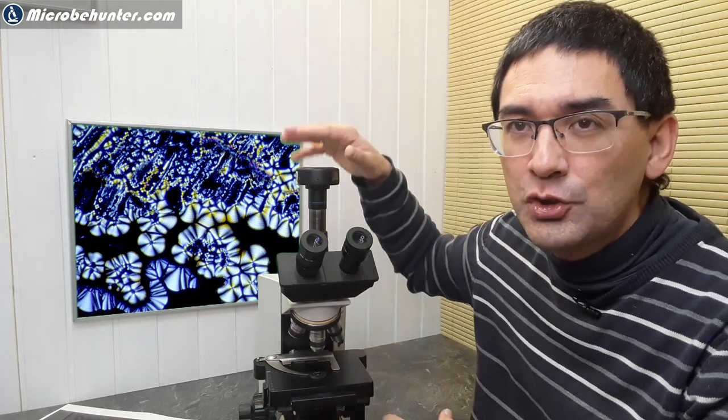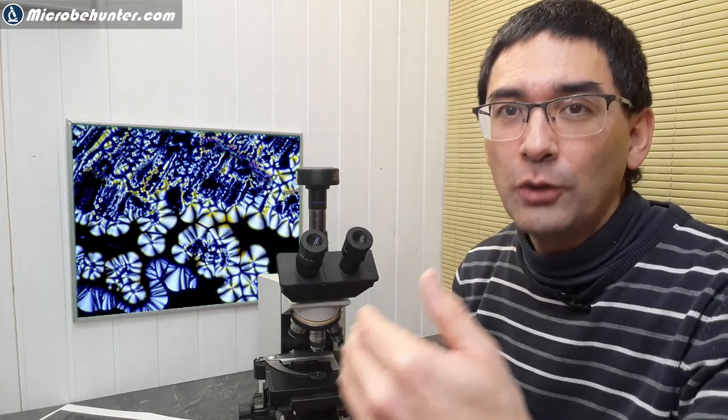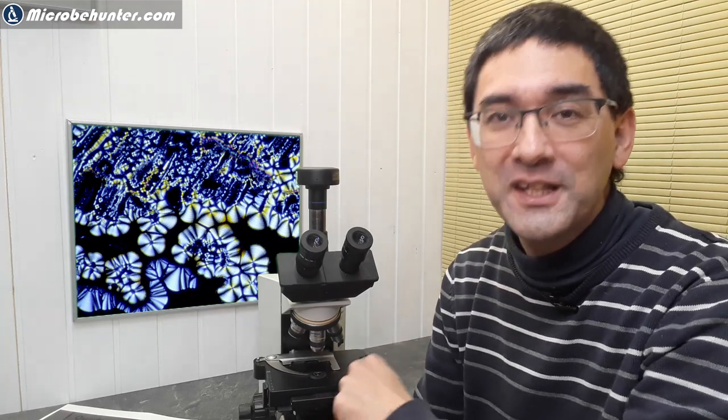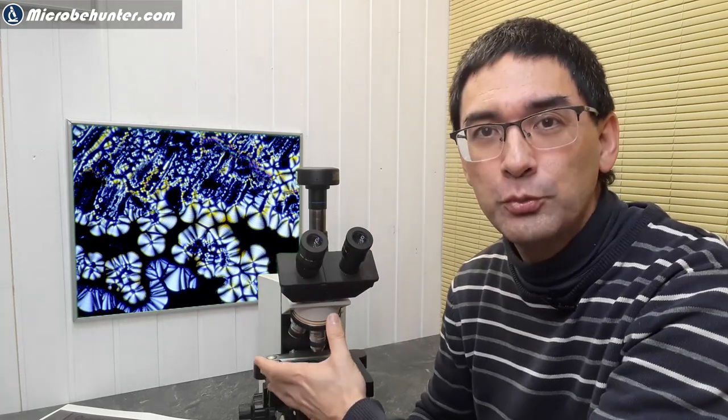However, when we get the magnification on the sensor here and when we display it on a screen, then the total magnification, the total lateral or linear magnification, depends on how large I display the image on the screen. So what I have to do then is divide the size of the image on the screen by the original size of the specimen. And then I get a magnification value. And this magnification value, of course, has nothing to do with the magnification of looking through eyepiece and objective.